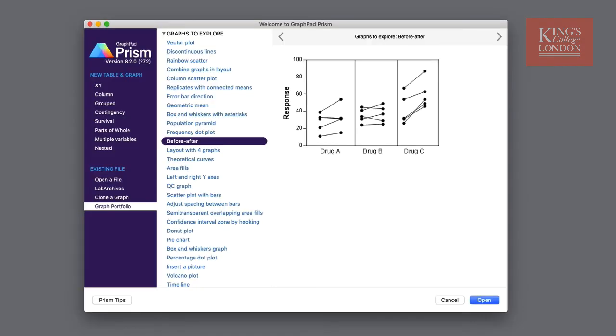Whether you're new to Prism or you want to delve deeper into the possibilities, I'm sure you'll find something useful in this welcome page to get you started.